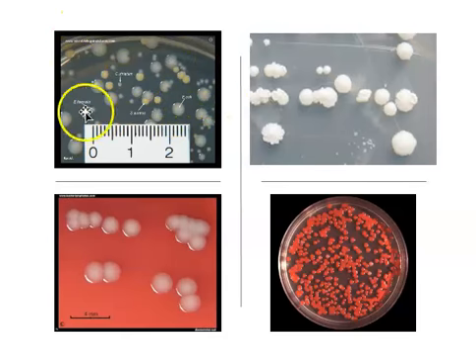So this happens to be an agar plate that was made from an environmental sample. It makes sense that I can see multiple types of colonies growing on this plate because environmental samples usually have multiple kinds of microbes in them. When I'm evaluating a plate like this, I would want to note that I can see 3 distinctly different kinds of colonies on this plate, and I would note the features of each one. Again, the size, the shape, the margin, and the elevation.